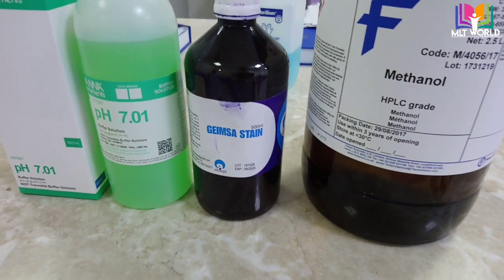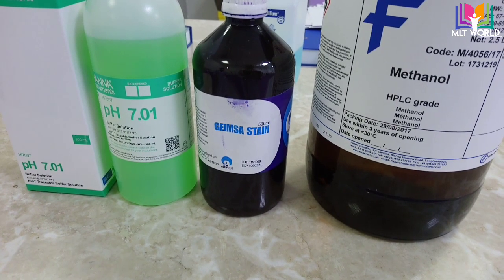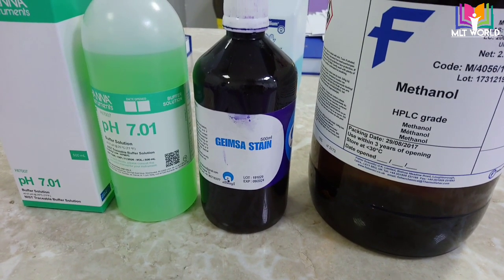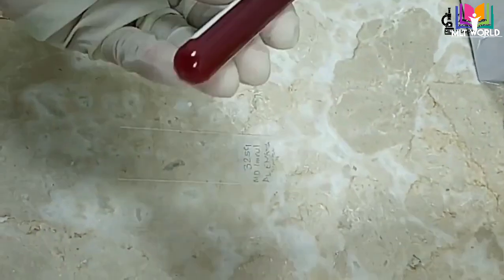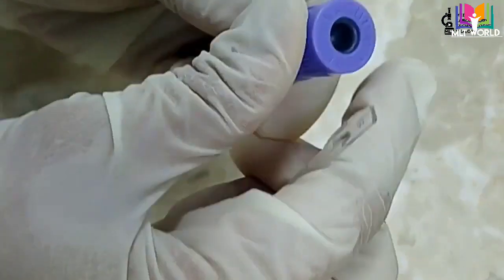Methanol is used to fix the smear. This methanol bottle is very big, so we will transfer it into a small container — like a urine container or any sterile container. It's difficult to handle directly from the big bottle.